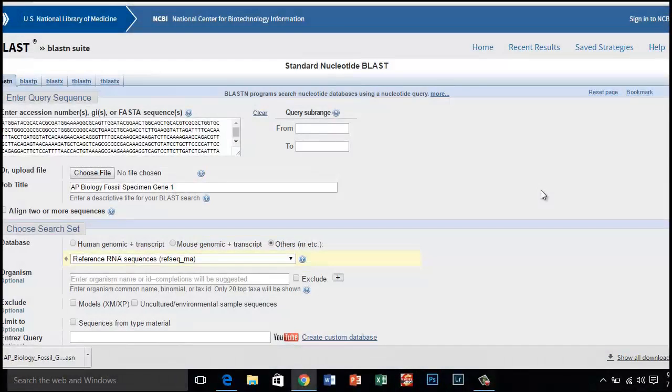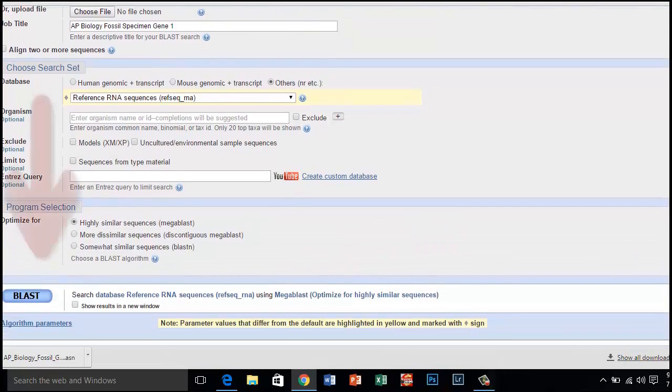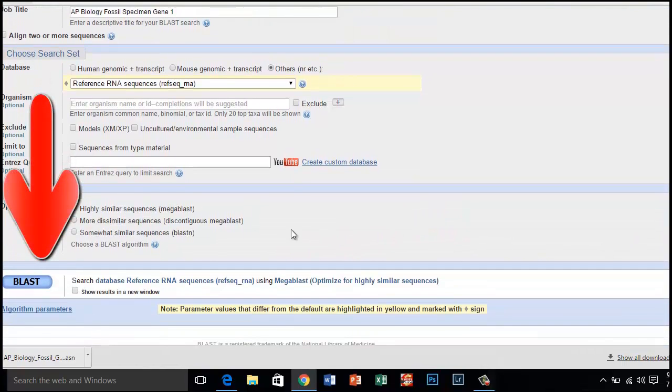A screen will appear with the parameters for your query already configured. Do not alter any of the parameters. Scroll down the page and click the BLAST button.